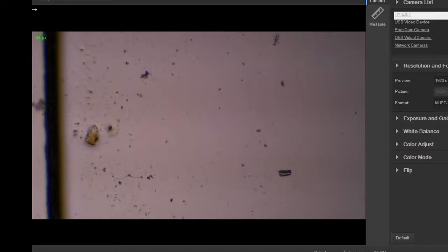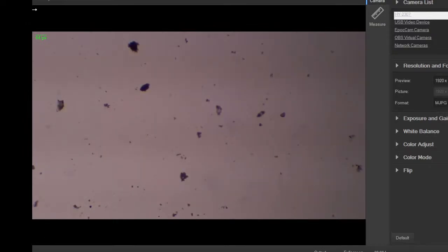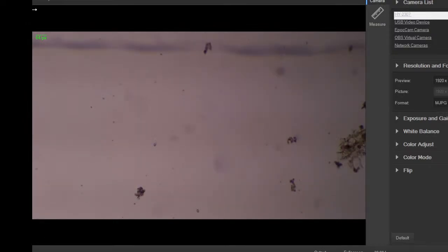All this area is now pretty dry. So anything that's still moving is inside that boundary. But where did the rotifer go?